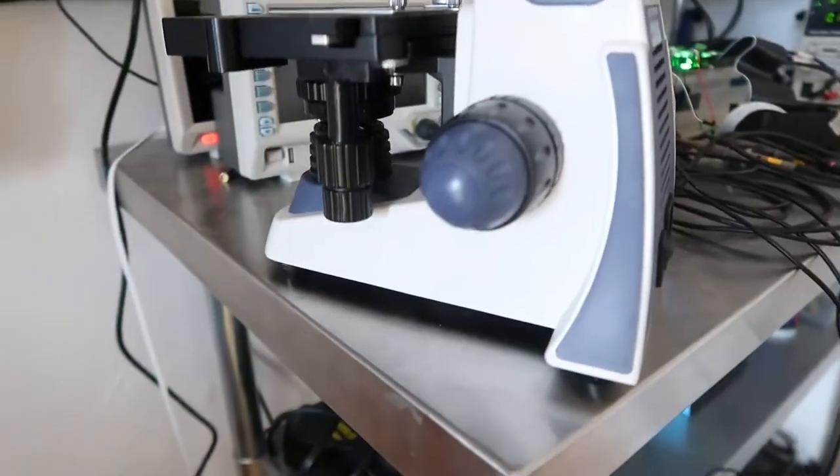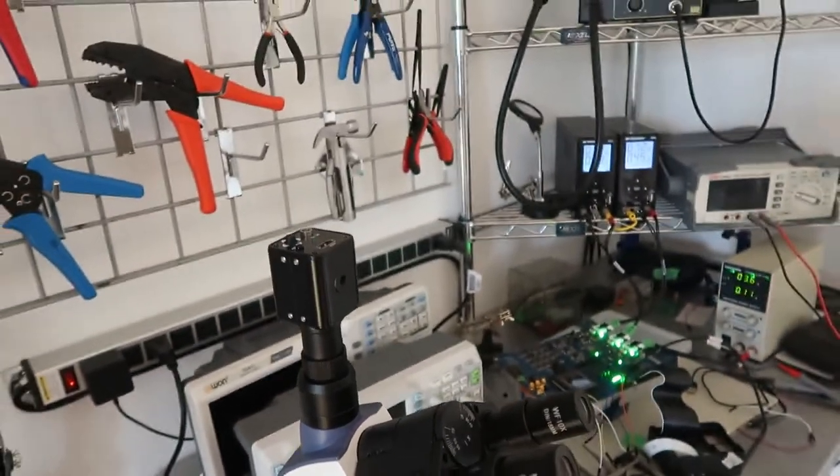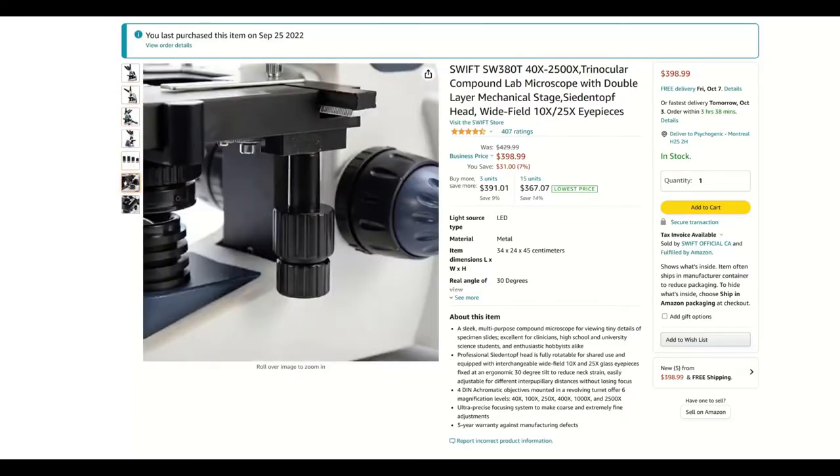It comes with 10X and 25X eyepieces. The 10X are fine, but the 25X are full of distortions and artifacts, so I stick with the 10X — except maybe for the iris diaphragm adjustment. Overall, it feels very solid and is a nice piece of kit for a very decent price.